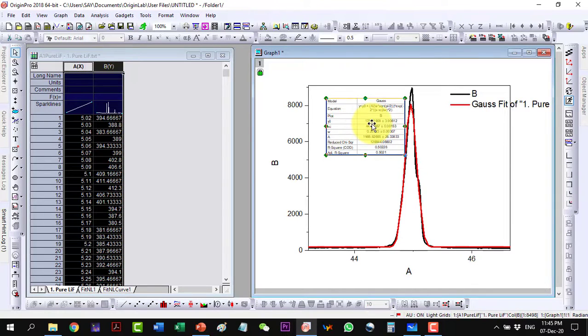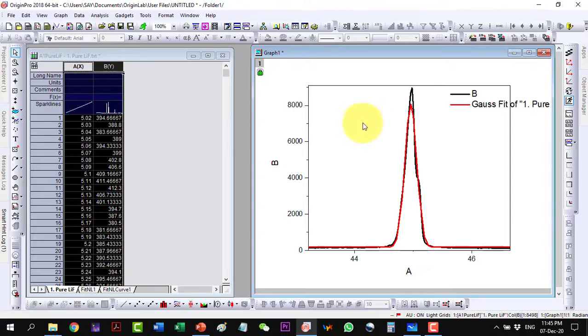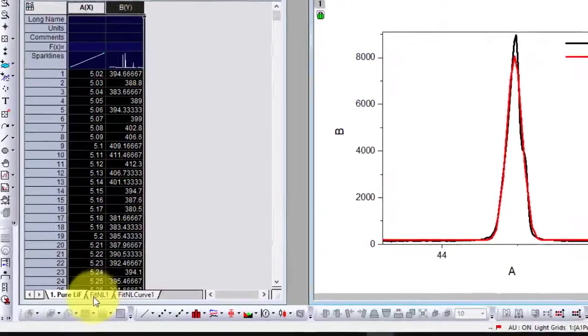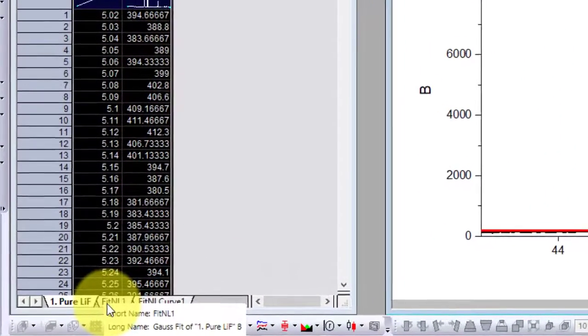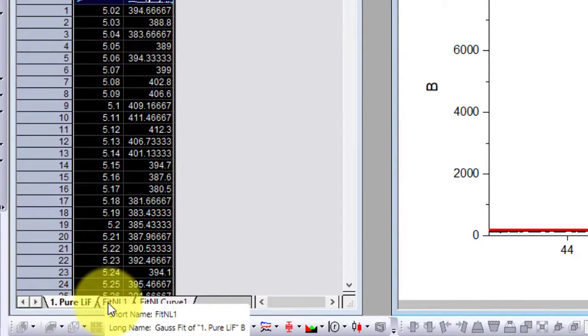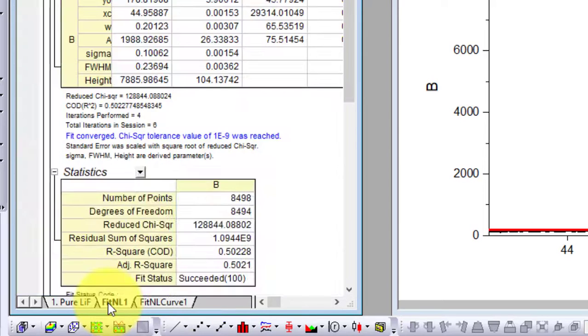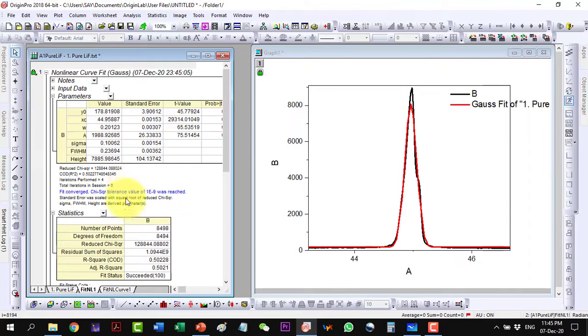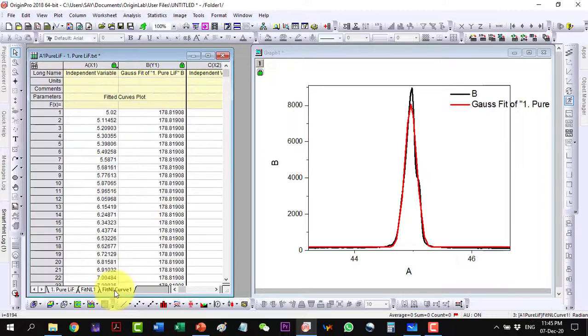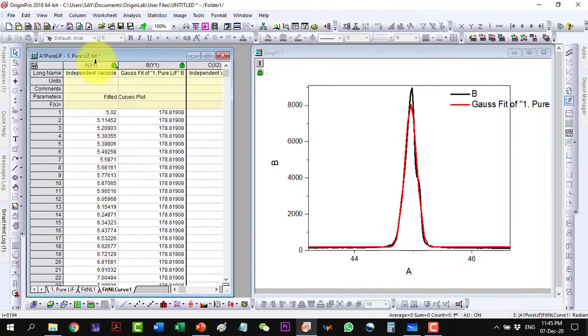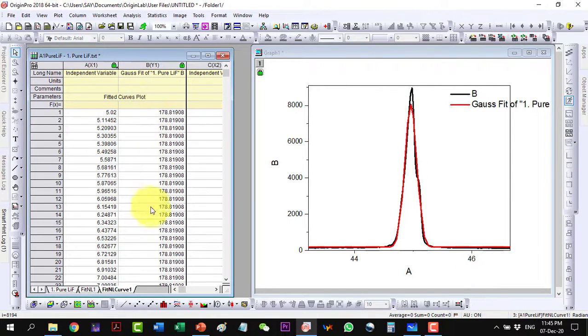This one is not required so let me delete this one and go to the FitNL1 sheet and here all the information is given and this is giving me the values of the plot.